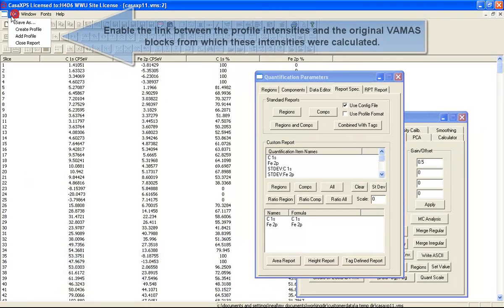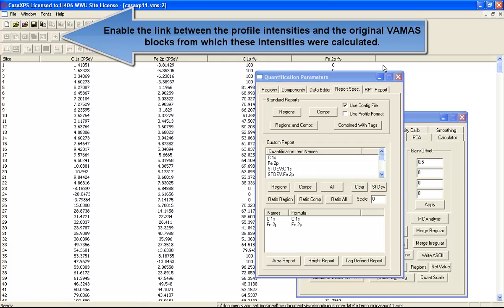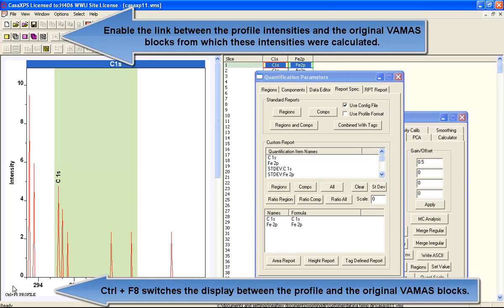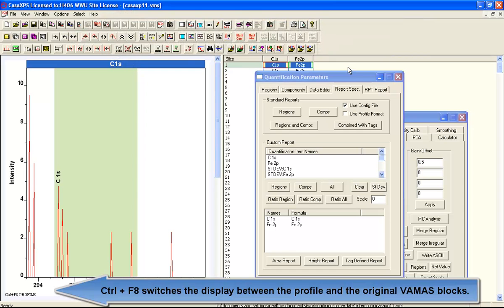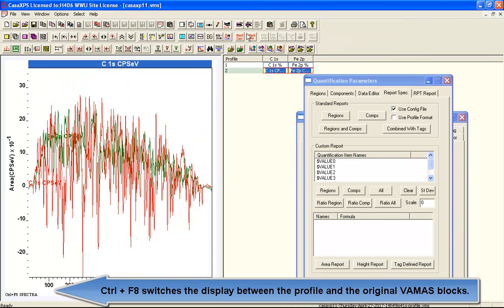I've created a pair of regions, one for the C1S and one for the iron 2p. Using the custom report, I've created a profile which gives intensity as a function of the slice.